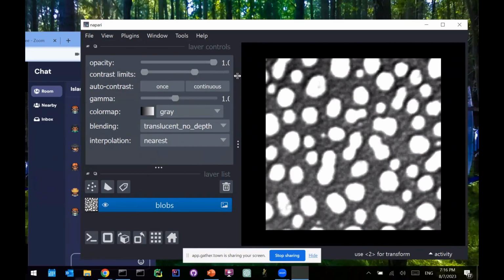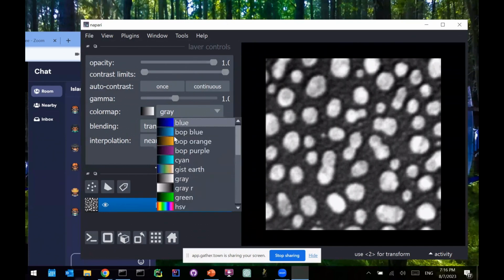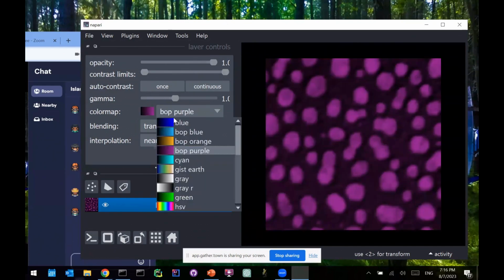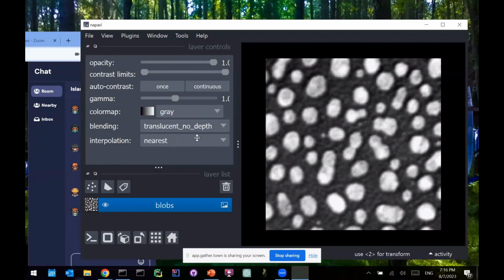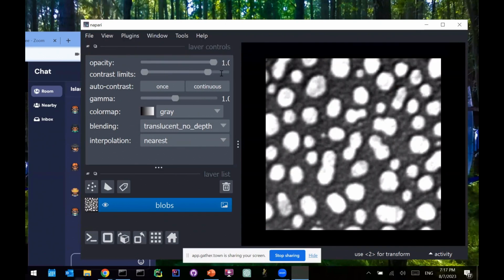You can change how this image is visualized. You can also change the lookup tables if you want to see it in a different color. These are typical things you find in this particular region. Again, when you right-click here, you can fine-tune very precisely how the image should be shown. I just quickly remind you of this nice tool. When you hover with your mouse over it, it also gives you a hint.